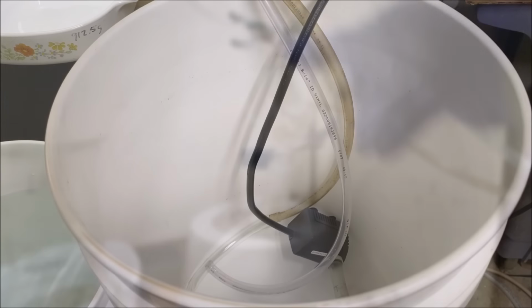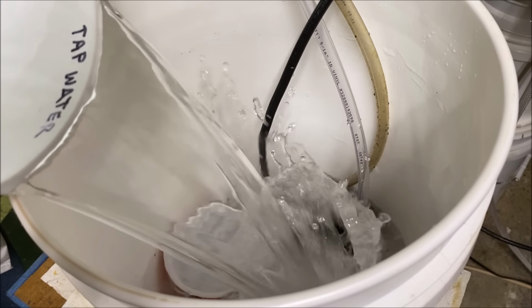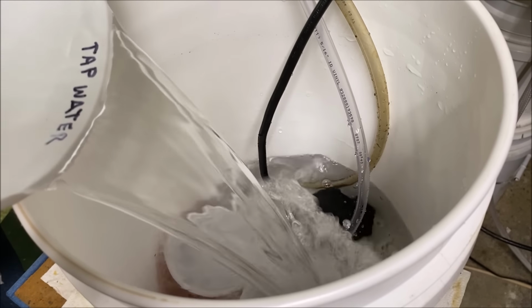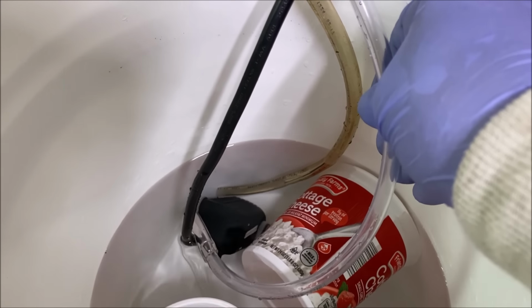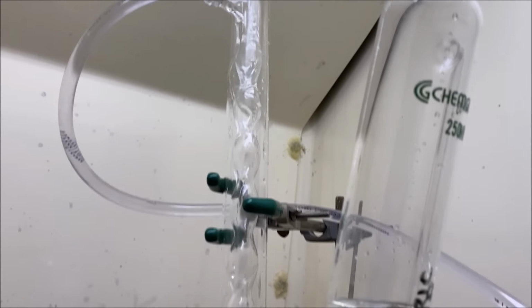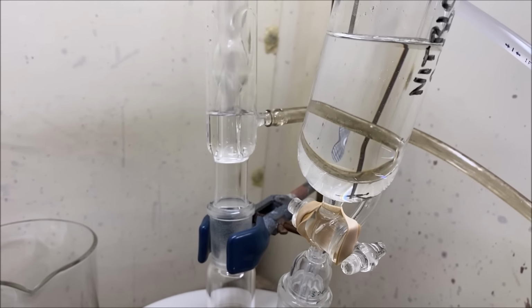This is gonna be our cooling water reservoir. I'm adding a couple chunks of ice. Clear hose is the discharge from the pump. And as per someone's recommendation, I'm turning the pump on right now. I've got the water flow going to the top of the condenser and then the drain coming down the bottom.